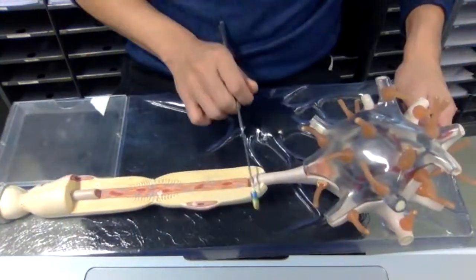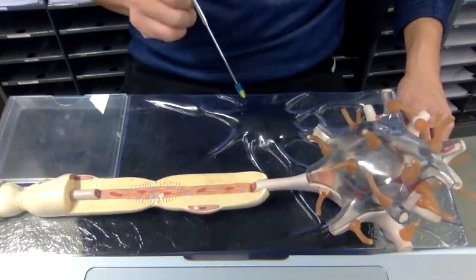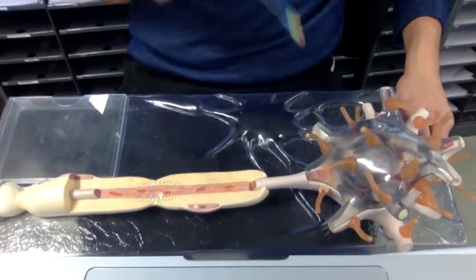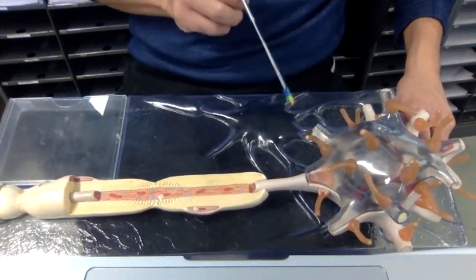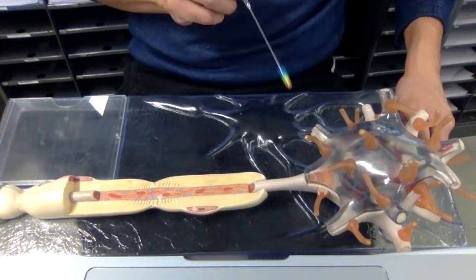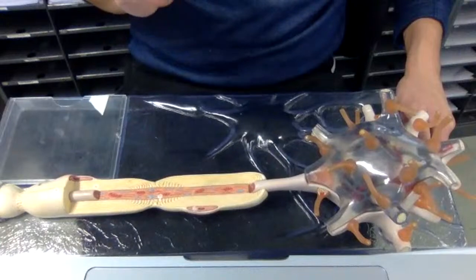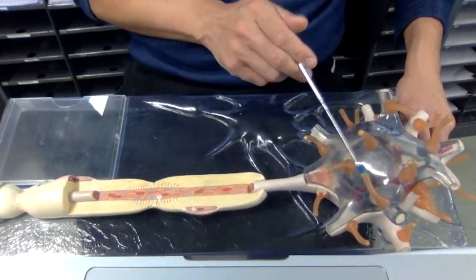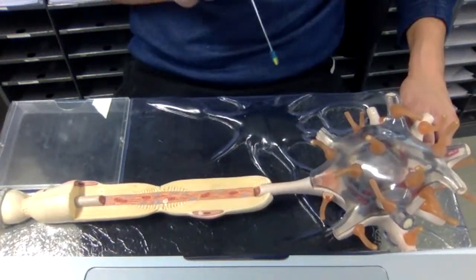Given that these are Schwann cells and that this is multipolar, can anyone tell me what kind of neuron this is? Is this a sensory neuron, a somatosensory neuron, a special sensory neuron, an interneuron, or a motor neuron? Those are your four choices: special sensory neuron, somatosensory neuron, interneuron, motor neuron. Given that it's multipolar and has Schwann cells, what kind of neuron is this?